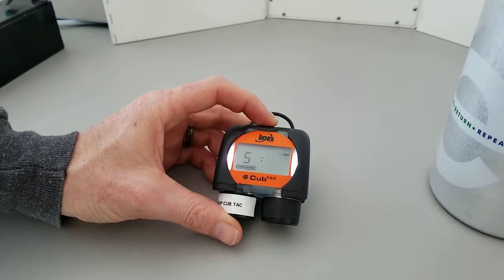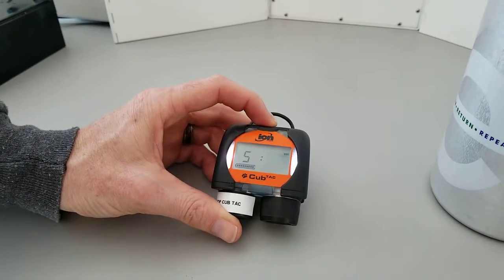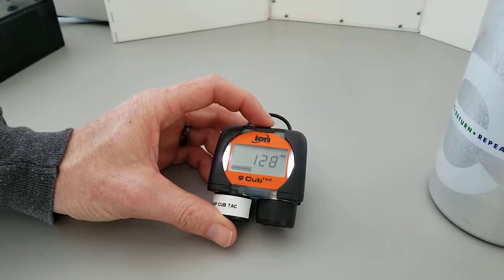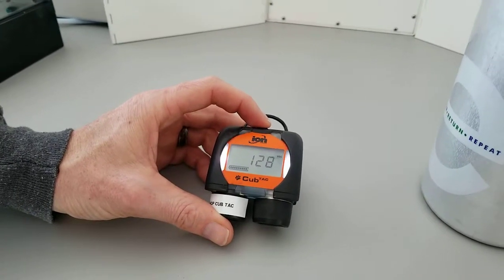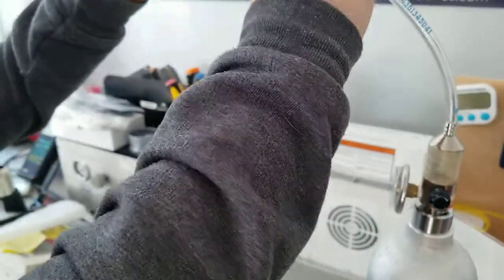We're on to the next stage, which shows an 'S' on the screen — the S is for span. We'll do the same again and press the button to proceed. The unit shows us a digital representation of the signal.